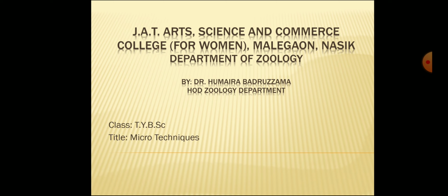My topic is microtechnique. Microtechnique is used for the formation of permanent slides. For many biological studies, the pathological investigation is performed with the help of a technique by which the material or slide is prepared using microtechnique.